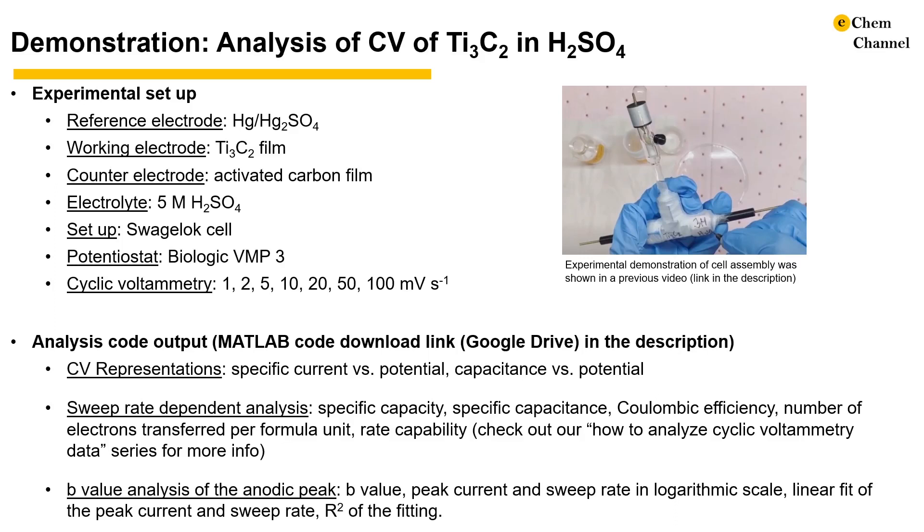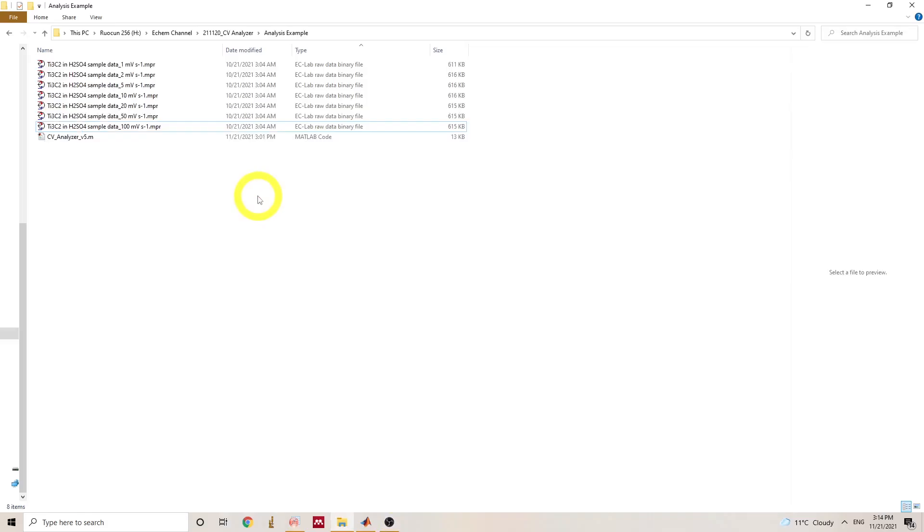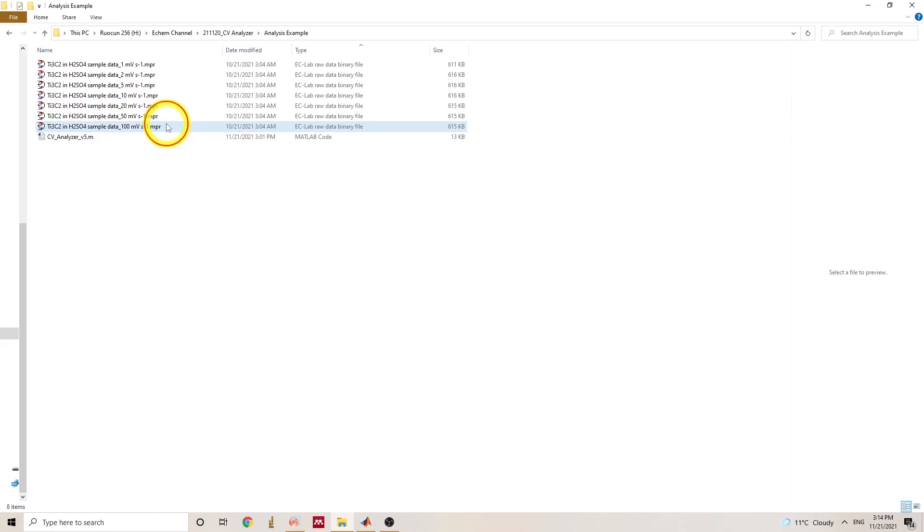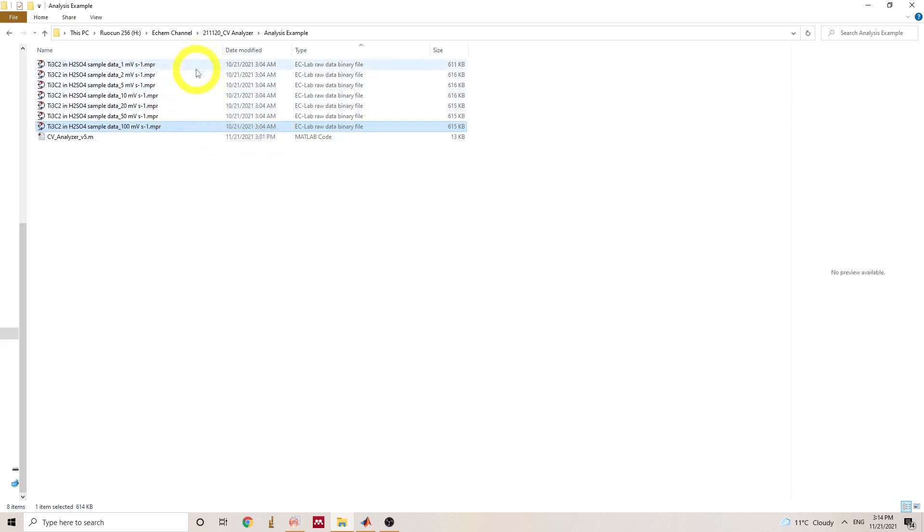This analysis code only works if you have MATLAB installed on your computer and follow the instructions. Next, we are going to show a demonstration of the CV analyzer analysis code using the cyclic voltammetry data of Ti3C2 in sulfuric acid electrolyte. Here we can see the CV ran from 1 mV per second to 100 mV per second.